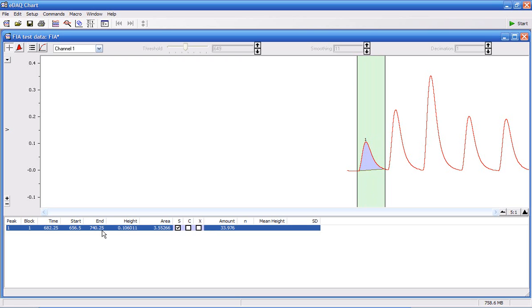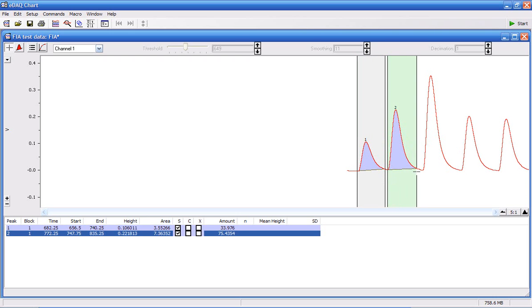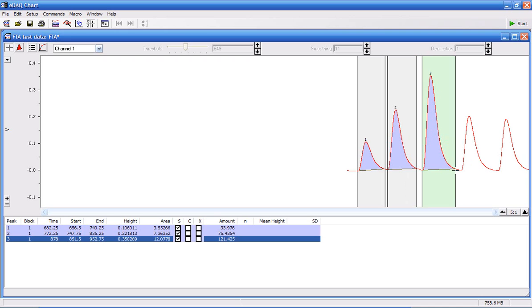I'm going to do this for the remaining peaks. Move to the start of the peak, press and hold the mouse button, and move to integrate the peak.